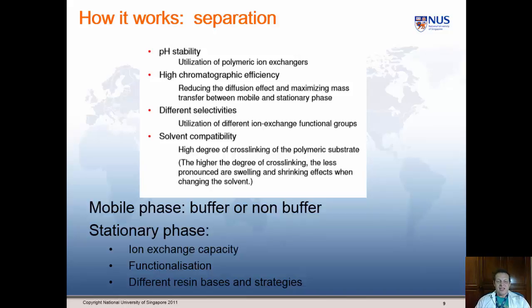And the stationary phases, there's a number of different factors here: the ion exchange capacity, the functionalization or the mixture of functionalization that you use, and these are commercially available, so one just needs to look them up, and different resin bases and strategies. I'm just going to pause there for a moment and look at a couple of those very lightly.